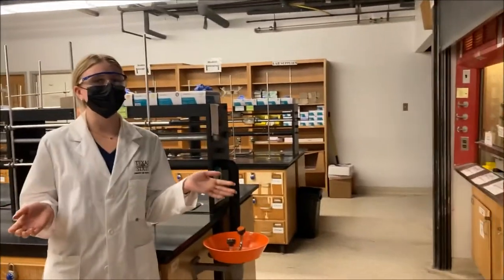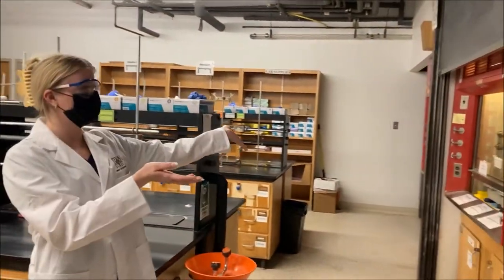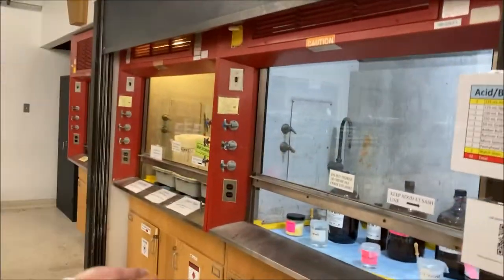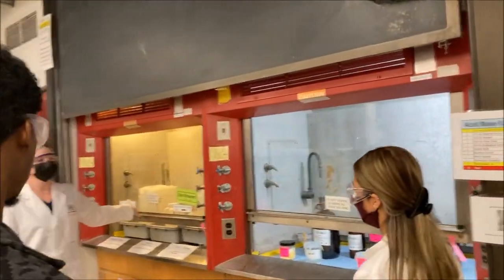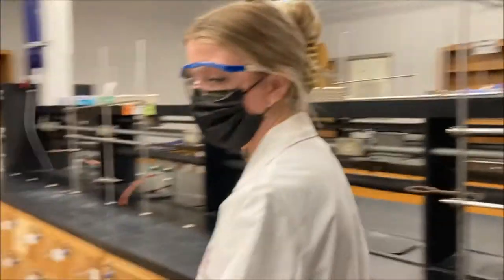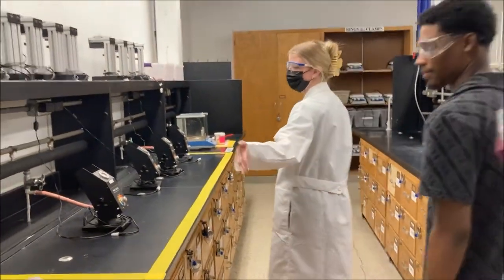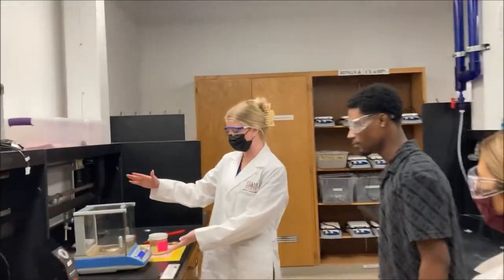Welcome to organic chemistry lab. The first thing you see when you walk in is two waste containers: one for your organic solid and liquid waste, and one for your chemicals. Further down, you have a bench with all the supplies you'll need for lab, your melting point stations, and a scale.